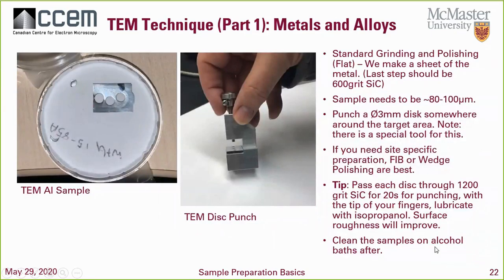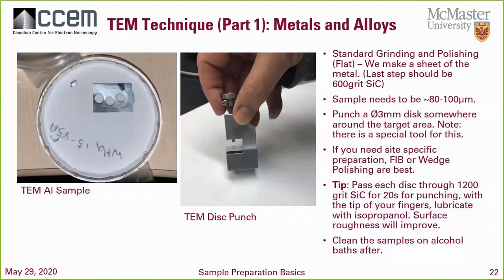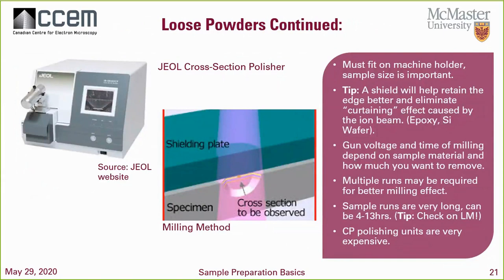Now that concludes the SEM prep there. Okay, so after this, you would probably put your sample in the SEM after checking it and see if it works out. Obviously, you would have to prepare it further, as I taught you earlier, right? Nickel paint, mount it to the proper mount for the SEM, right? Make sure that you add your conductive layer, and if it needs a coating, you might want to consider a coating.